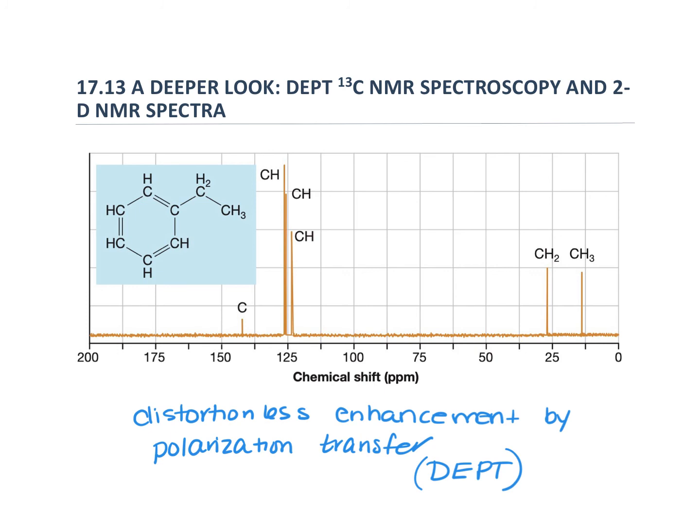And so what that shows you is it'll say, hey, look, this peak here is due to a CH3, right? And so that CH3 is that peak there. And that CH2 is that peak there. And then you can look and say, well, look, these CHs here are due to the CHs on the ring, okay? And so it will couple those for you as a summary.